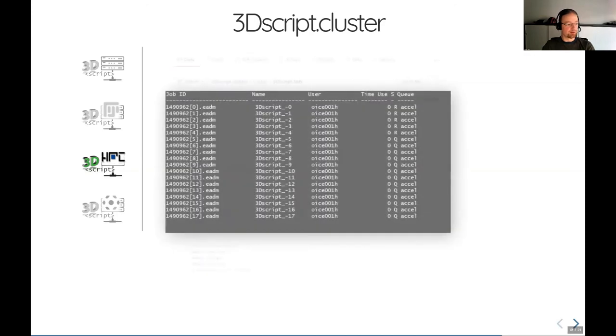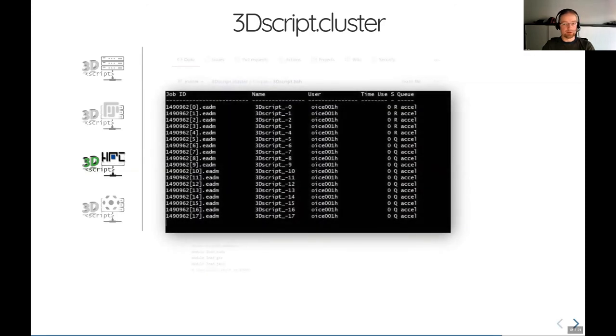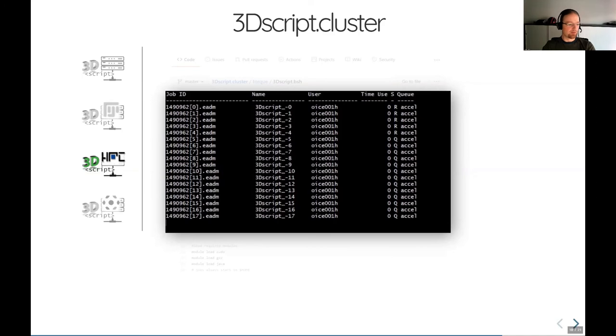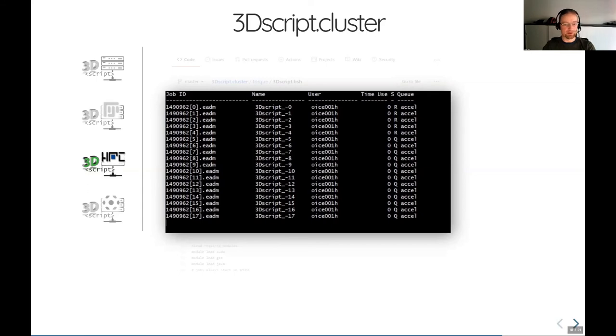So here you see it in action. That's a screenshot which shows 18 jobs submitted to the cluster from a single script. That's our local cluster here in Erlangen. You see five jobs are currently running, but that depends of course on the configuration of the cluster and on the resources on your cluster.